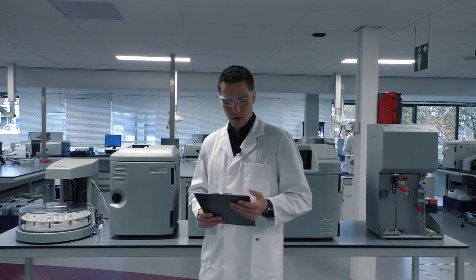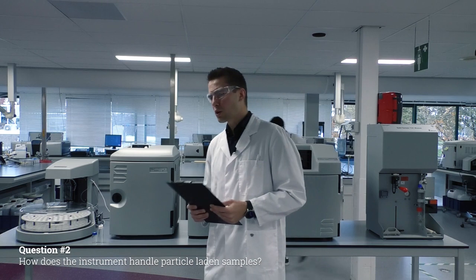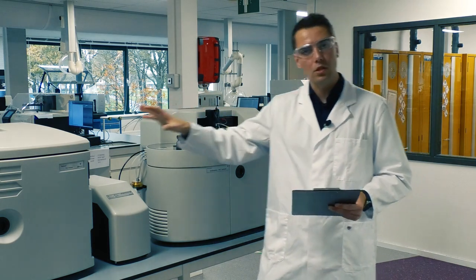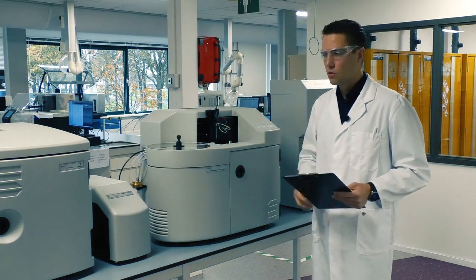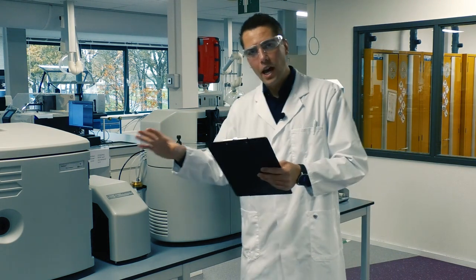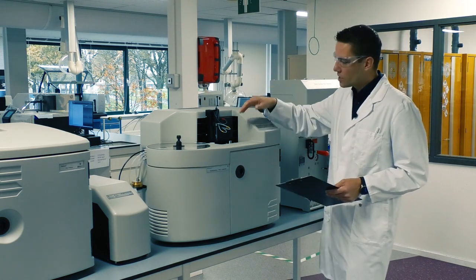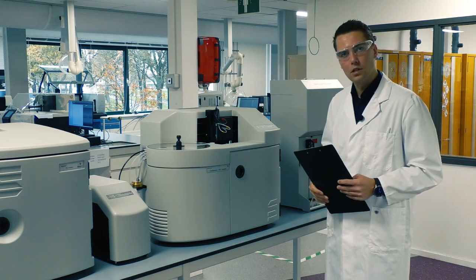Okay, question number 2. How does the instrument handle particle laden samples? Good question. Both instruments can handle particle laden samples, as both instruments can be set up with a bigger internal diameter needle of 800 micrometers. But if you're looking at extremely particle laden samples, as briefly discussed in question number 1, the FORMACS HTI with the direct injection principle is highly suitable for this.